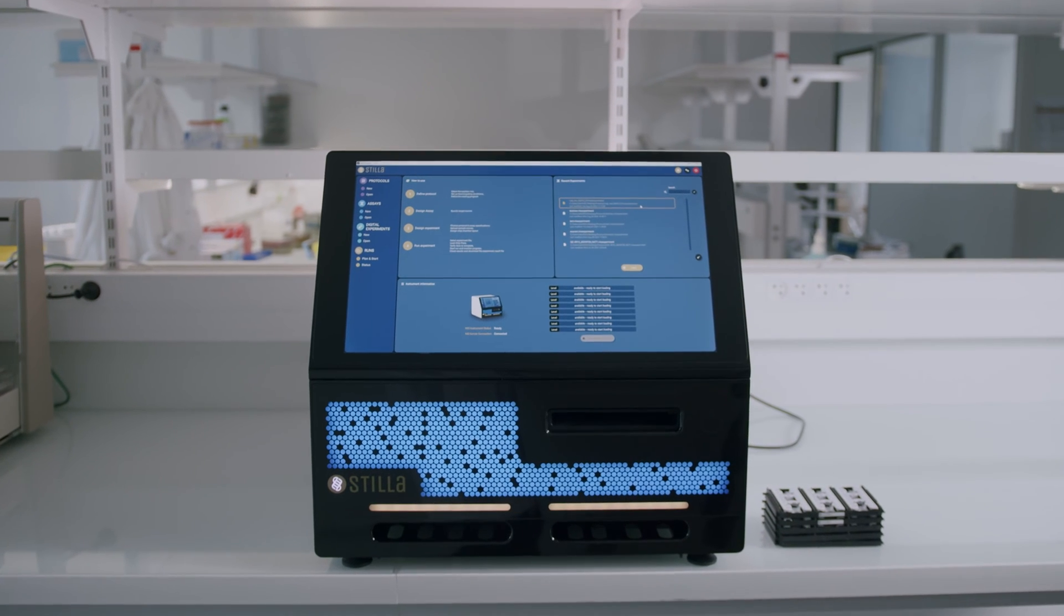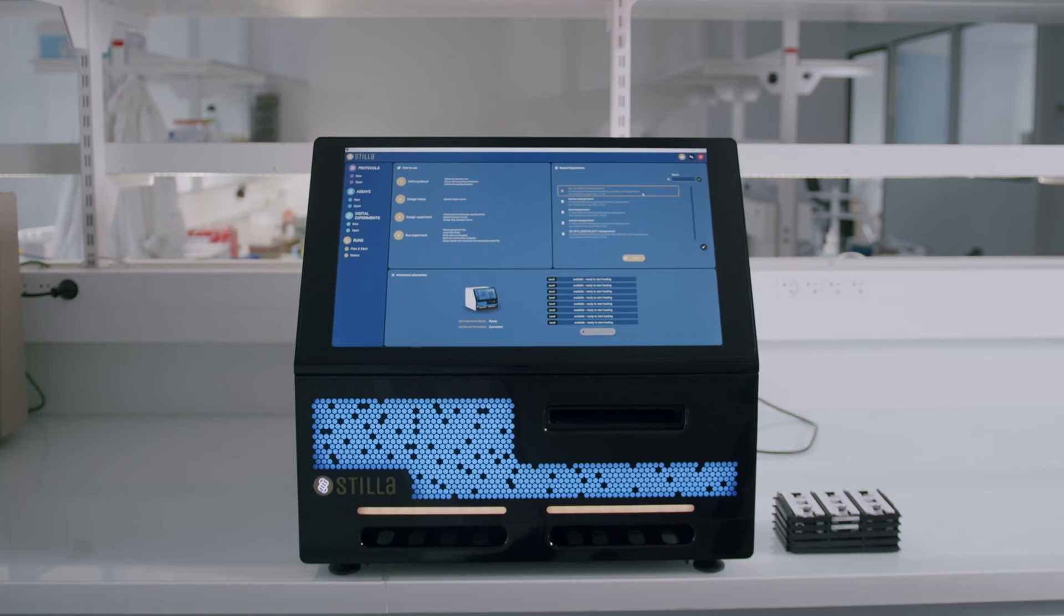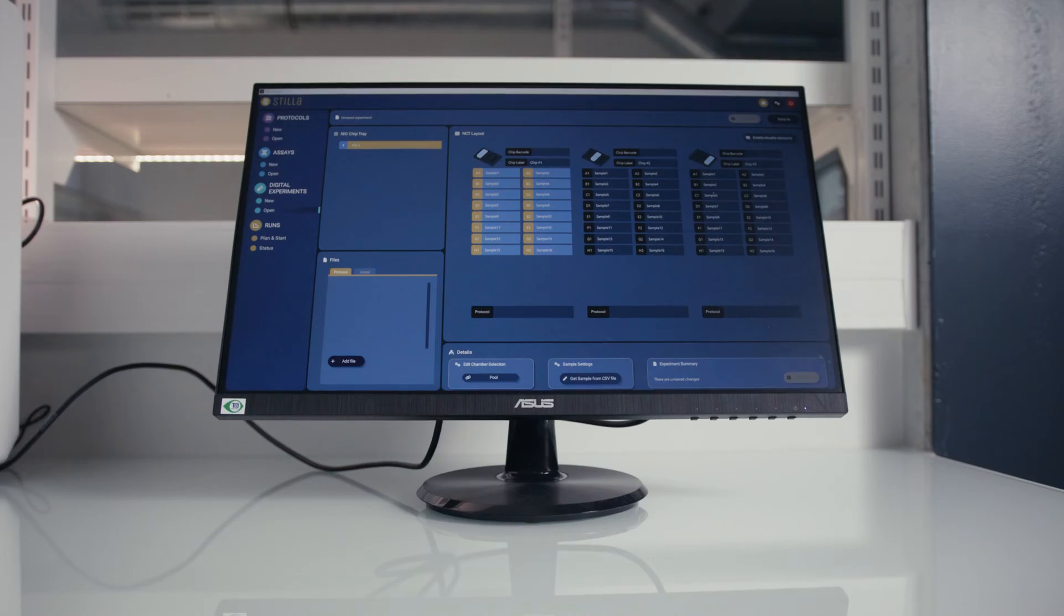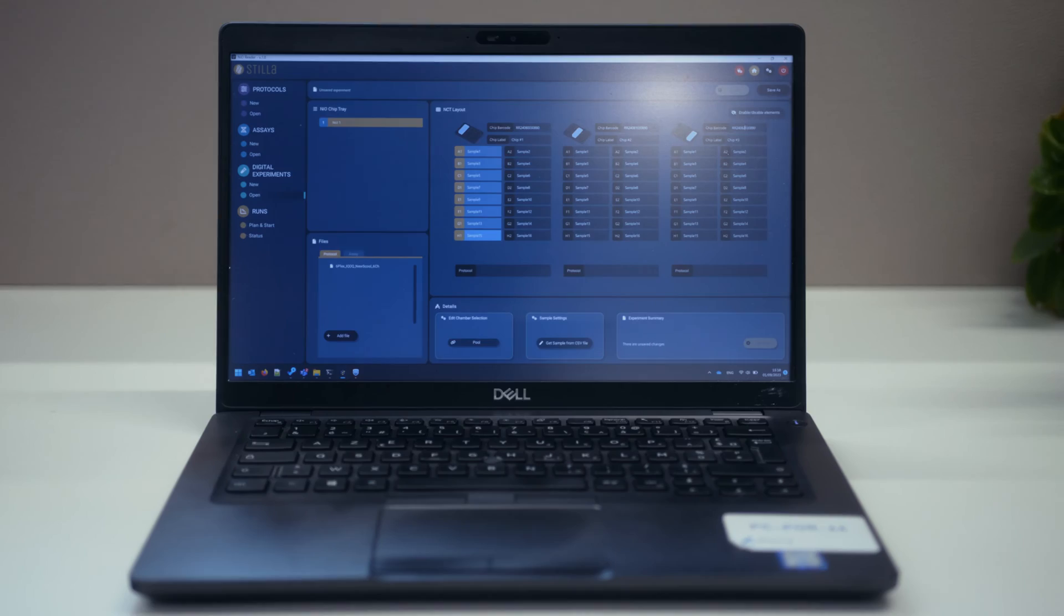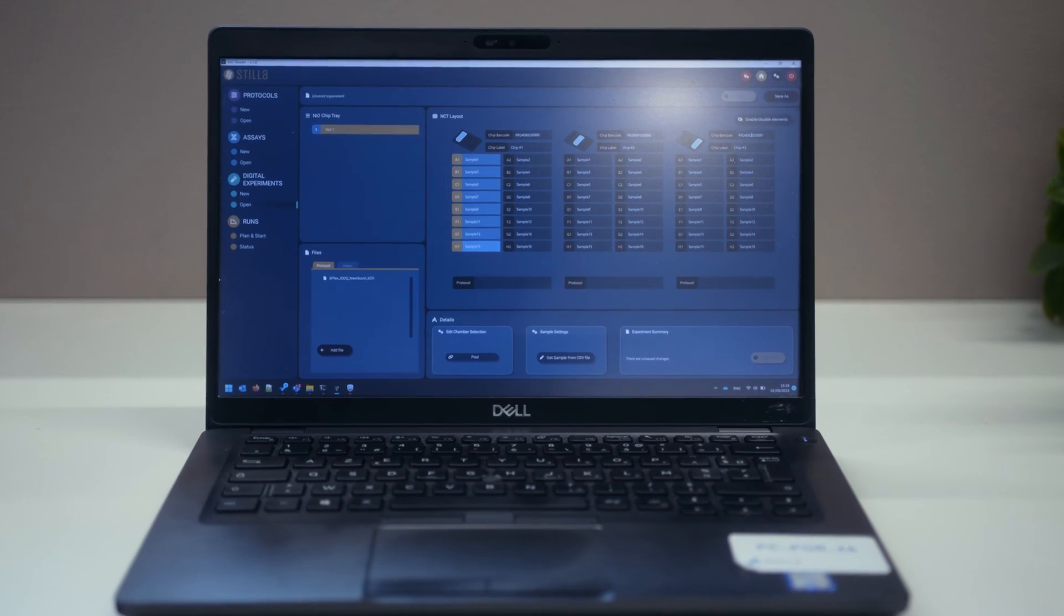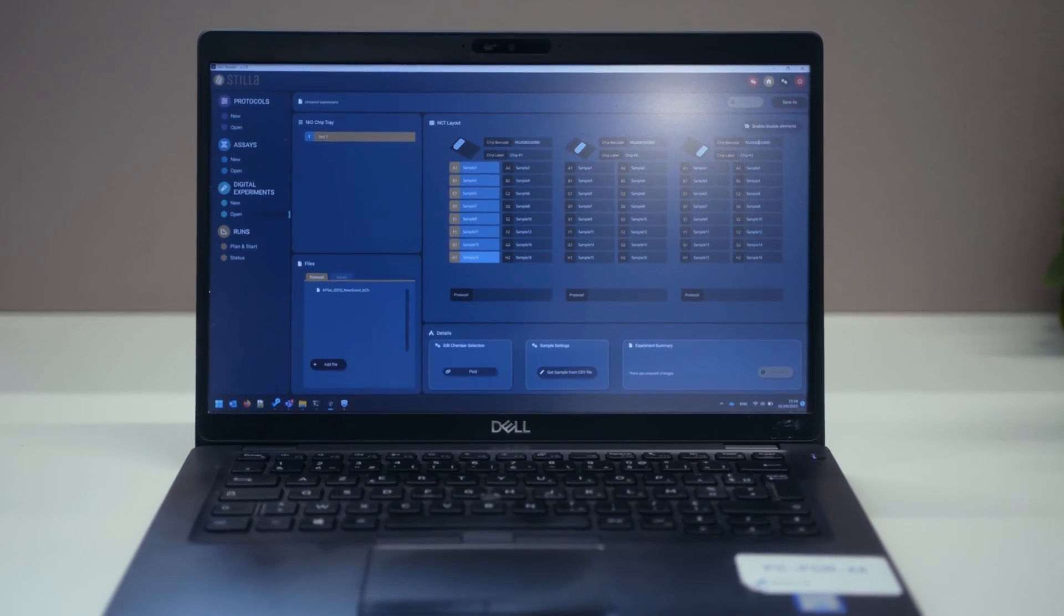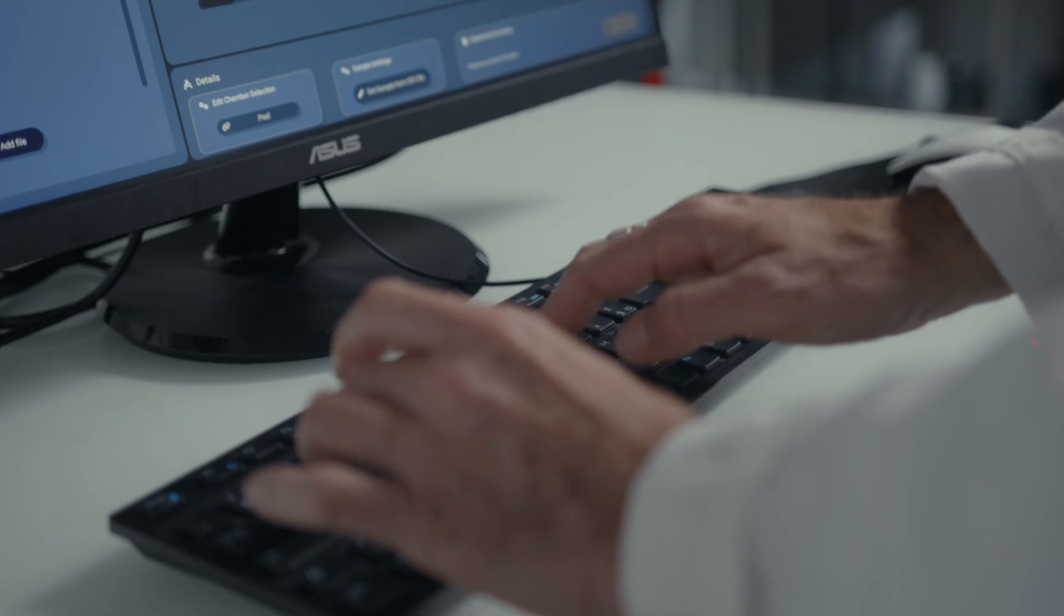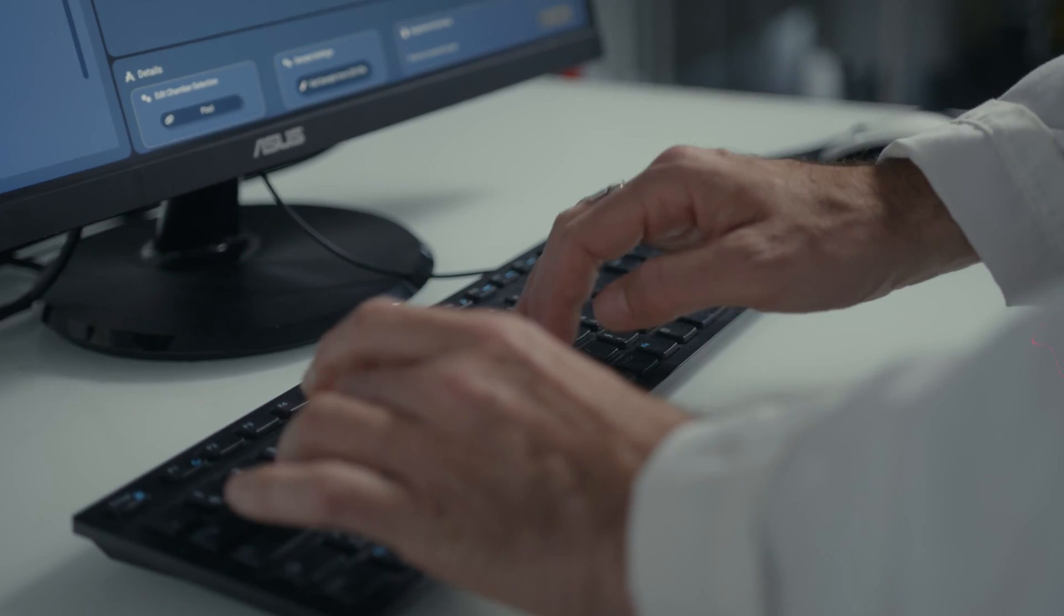NIYO is a fully autonomous, all-in-one, highly compact device. You can start experiments wherever, whenever, and you can make them as simple or as complex as your application requires.